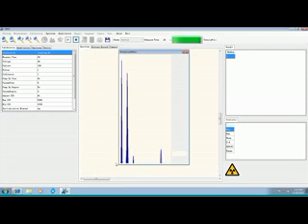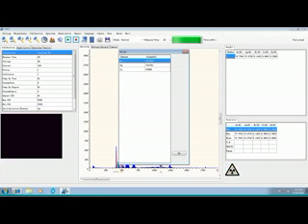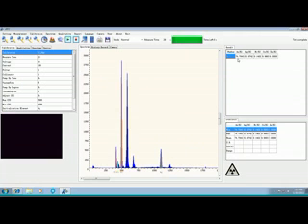Okay, so now it's done taking a reading and it tells us that this is 74 percent, 74.79 percent gold. It gives you my silver and my copper result. If you click okay, it just takes that screen out of your view.